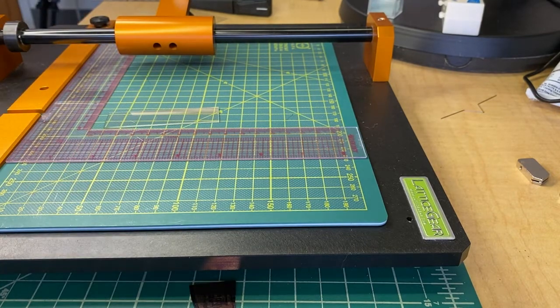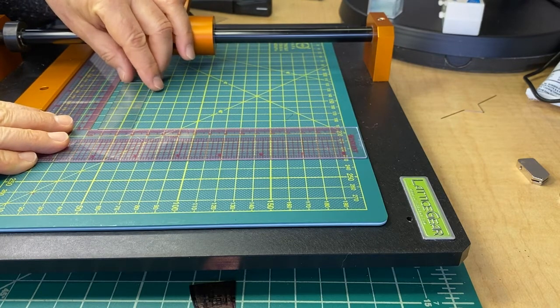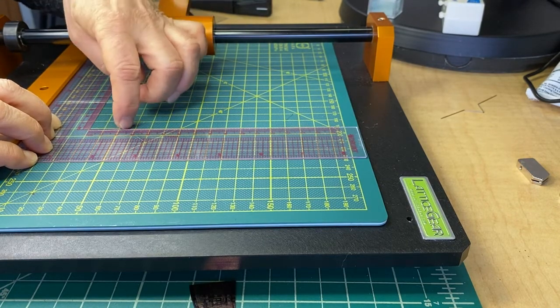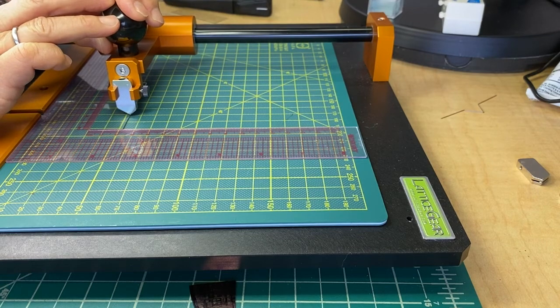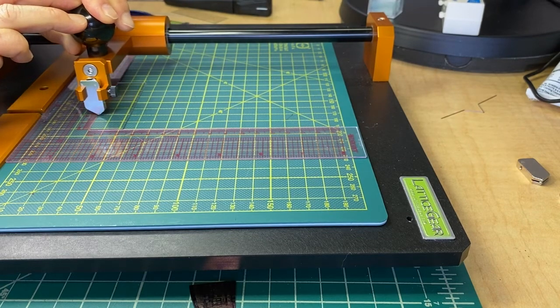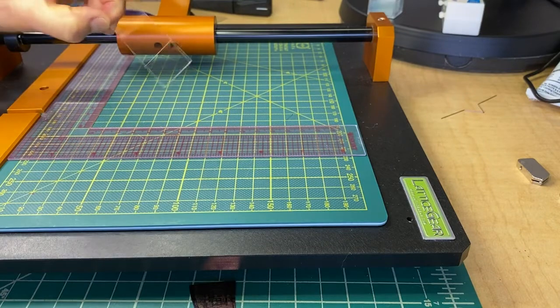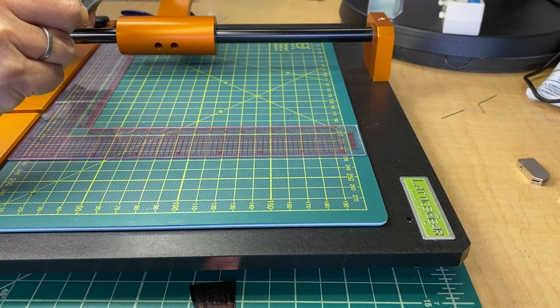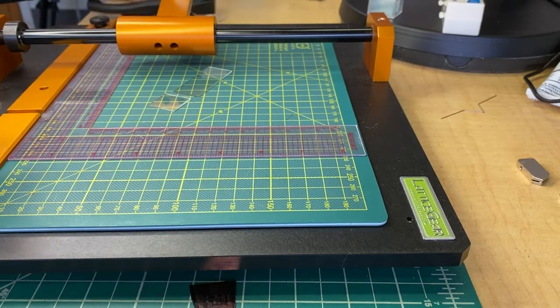Now we'll cleave the 22 millimeter pieces off the edge of this. I'm using a magnifying lamp to position my ruler. I make a scribe — you can see the line. Now I'm going to use larger glass cleaving pliers to cleave. There's one piece.